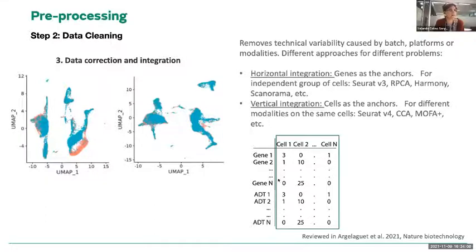But you also have some ways in Seurat 4 in which you can combine the information from both using a weighted nearest neighbor, I think it's called. They combine the information from both to generate a UMAP.